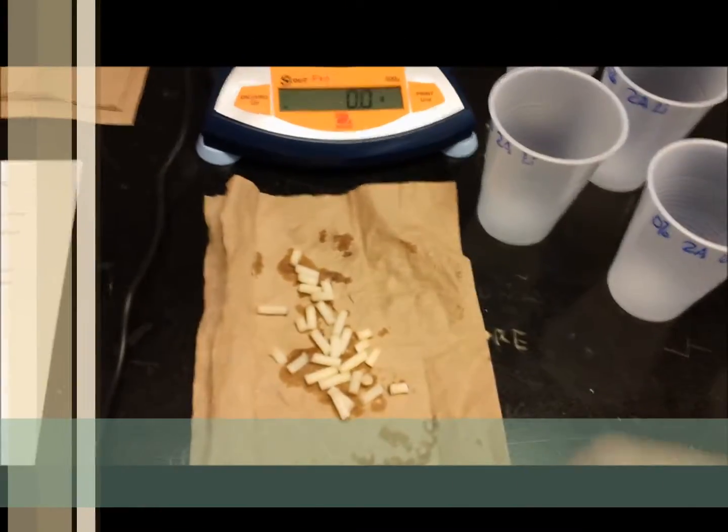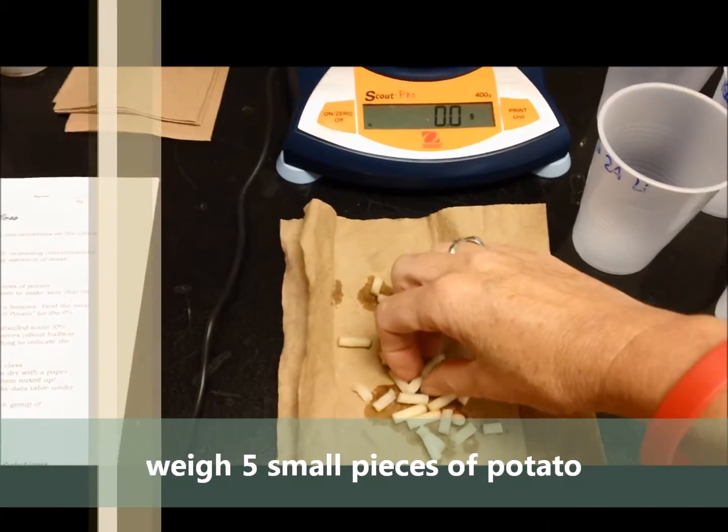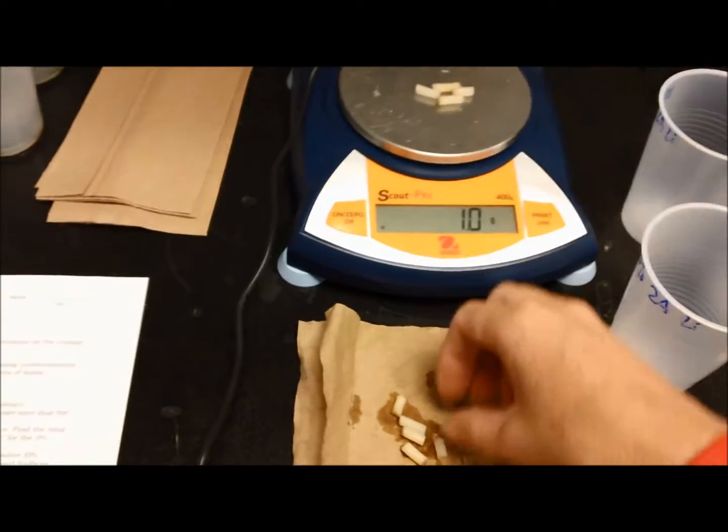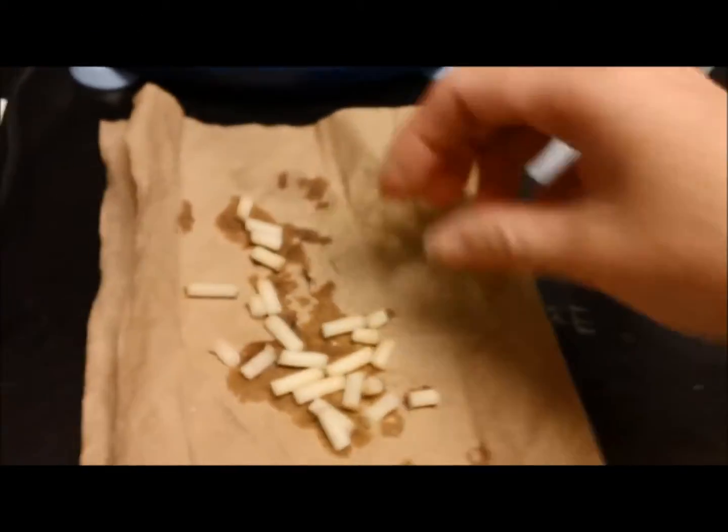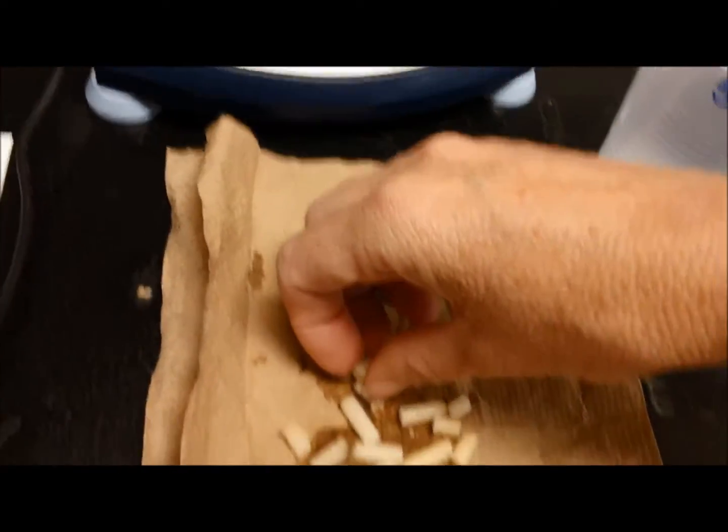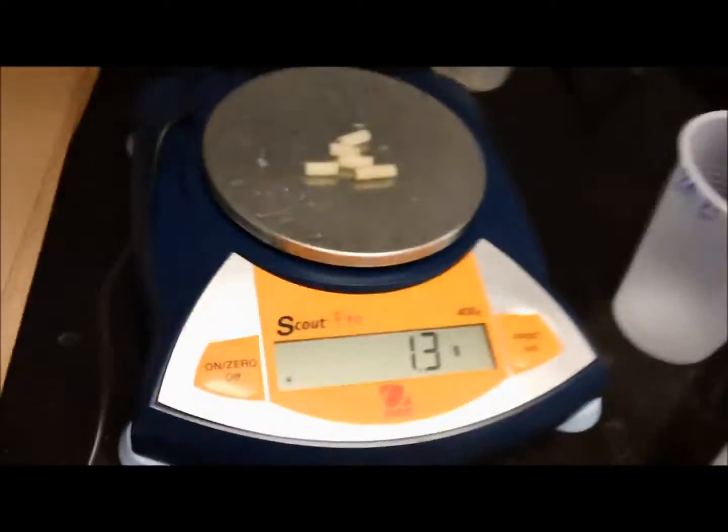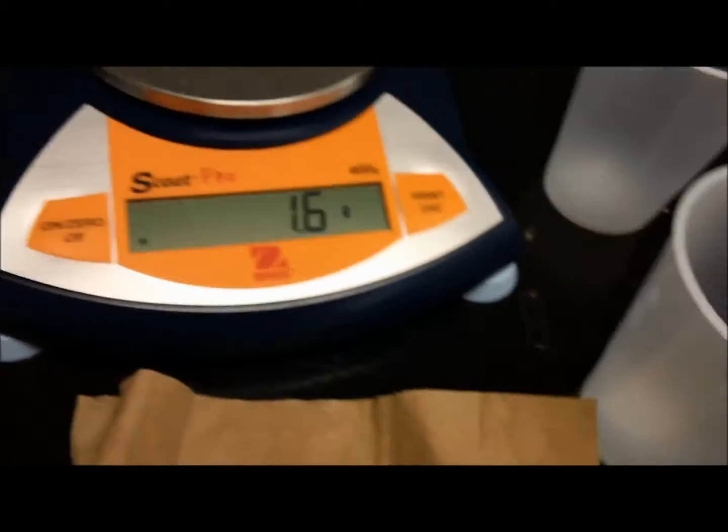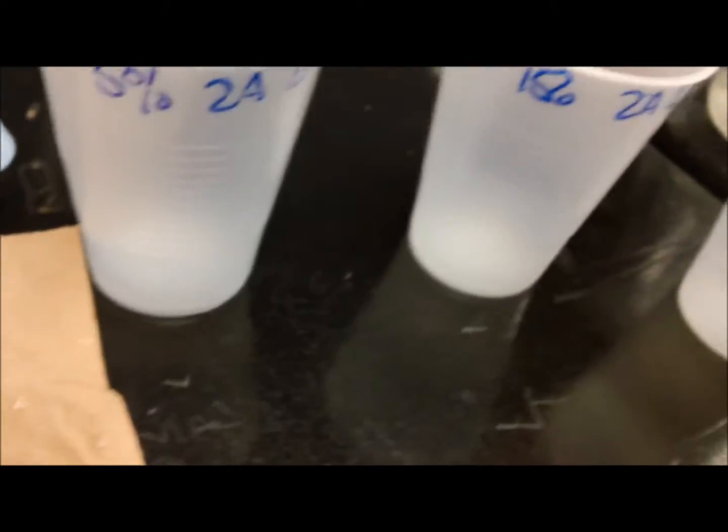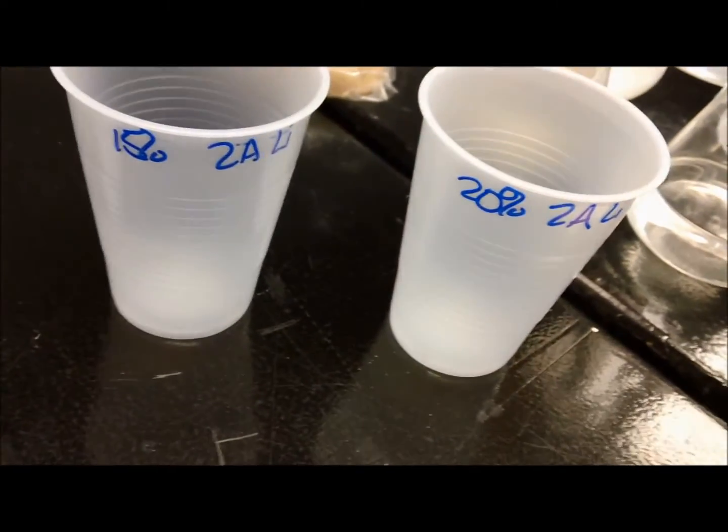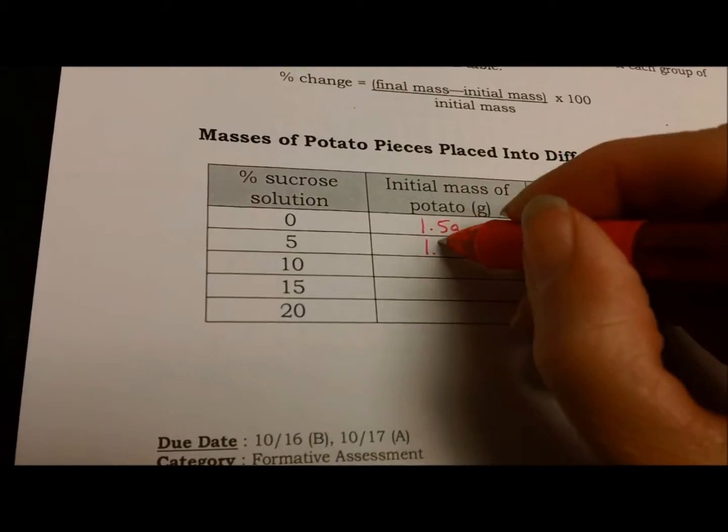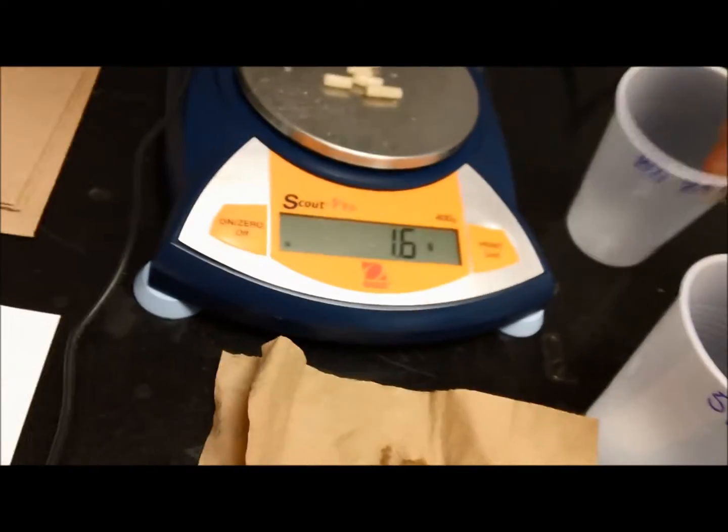Start by weighing out five of the small pieces of potato on the digital scale. Repeat this for the next four solutions: the 5%, the 10%, the 15%, and the 20% sucrose solution. Make sure you record each one before you add the solution.